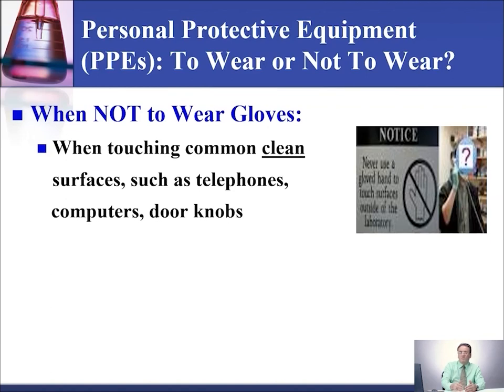You need to answer the phone fast, and if you are testing and resulting at the same time, you're going to take your gloves off all the time to enter in the computer. So these computers and phones in the dirty area, on the bench, next to the instrument, cannot be classified as clean areas or clean items.